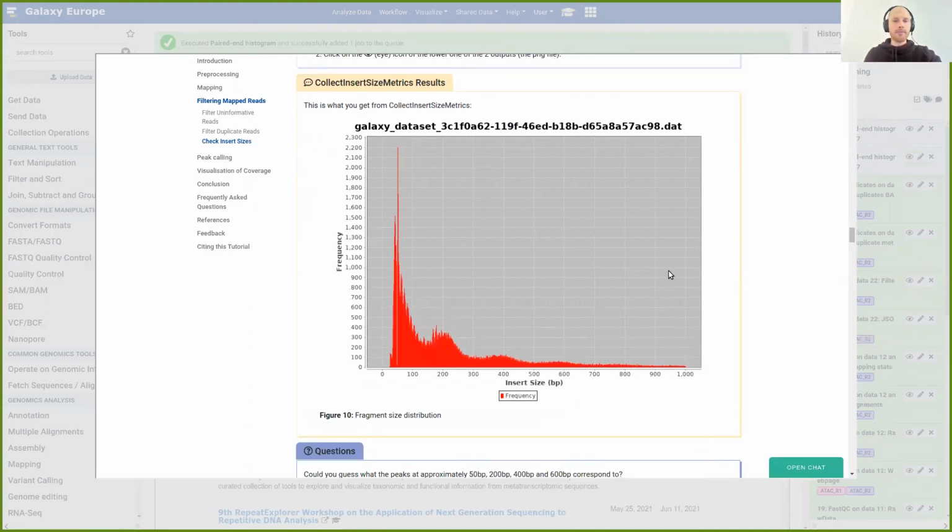And you can imagine you have now 2 mates. So one read, so they are 1 and they are 2. And there are different events or different pairs, so to say, for ATAC-Seq data. There is a potential of 2 pairs which are included in one open chromatin region. So no nucleosome in between. Then there is an event where 2 mates, so R1 and R2, actually surround exactly 1 nucleosome. And then there are 2 mates which surround exactly 2 nucleosomes and so on.